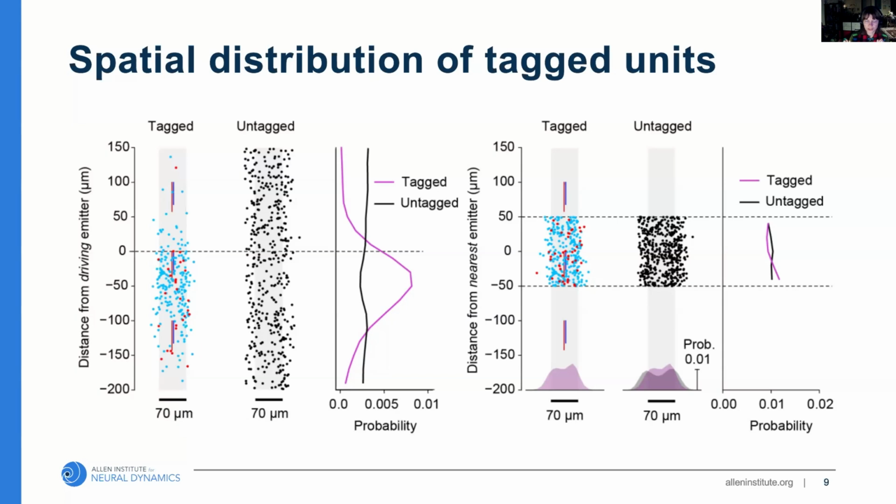So overall, the majority of units that are in range to be picked up by the electrical sites of the Neuropixels Opto probe are also in range to be stimulated by the light emission sites, although you might miss some units that are very, very far away from the probe and are just barely being collected.